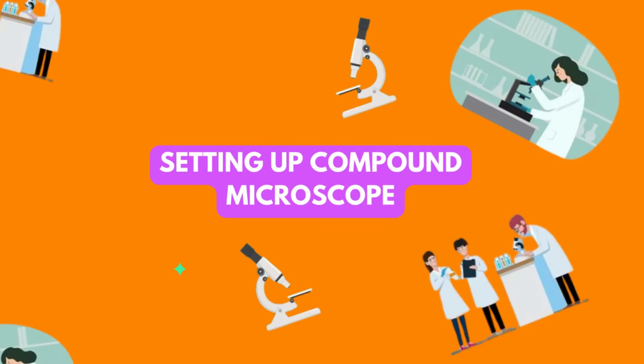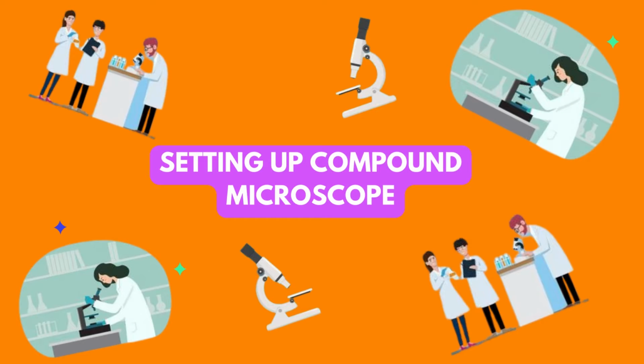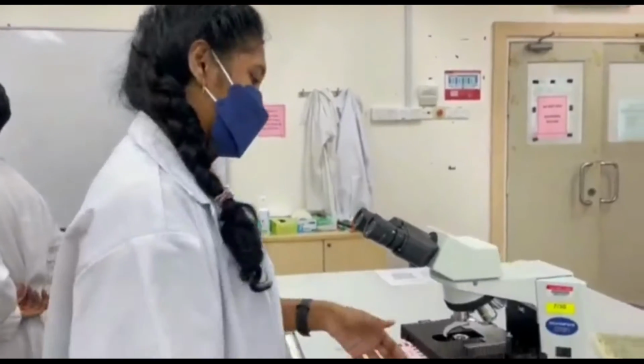My name is Yuasri Peresami. My matrix number is 066797. So let's look at how to set up a light compound microscope.